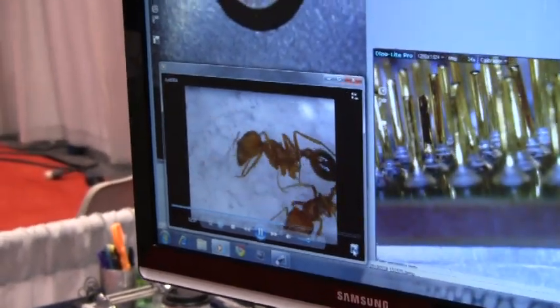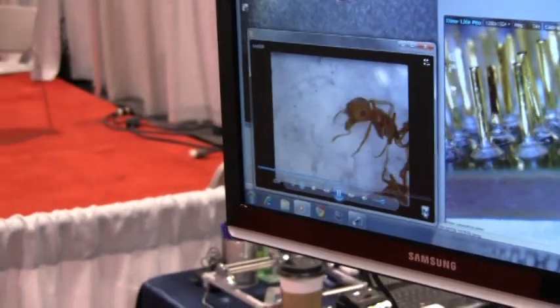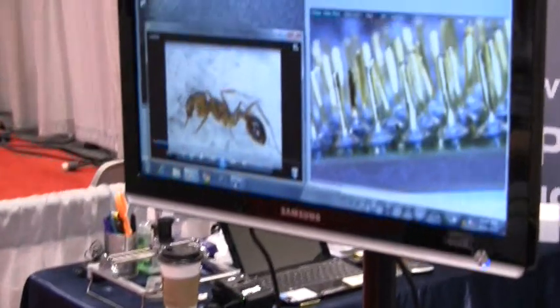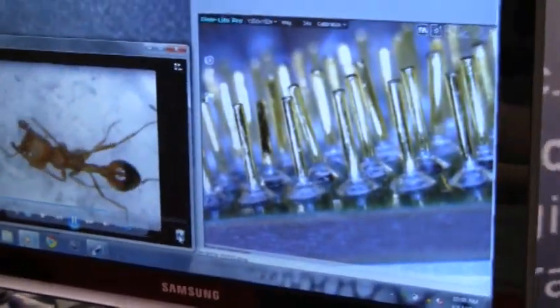You can use it for broadcasting, you can actually do a little webcam video conference with this, to show parts at higher magnification than a regular webcam can do.